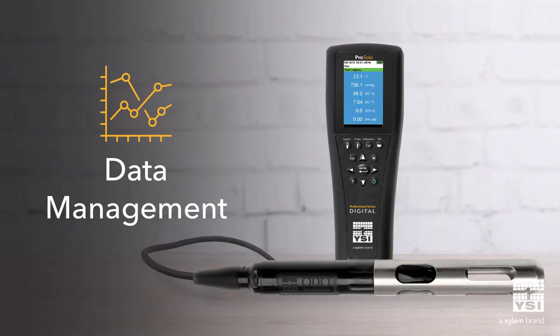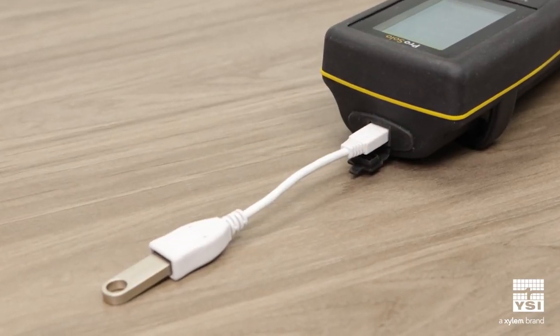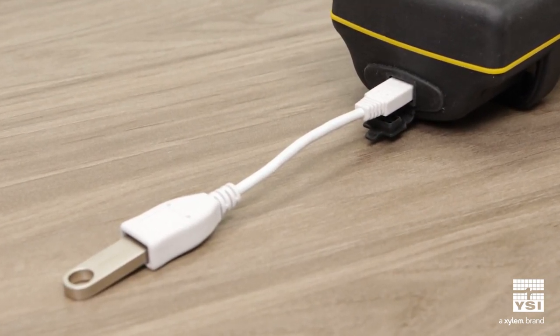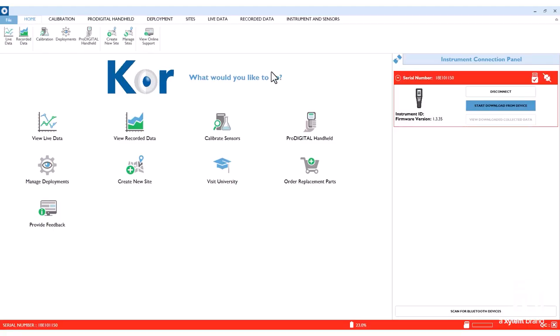Another advancement is that the ProSolo makes it easier to access your saved data. Simply connect your USB stick to the port on the instrument to download your data as a CSV file, bypassing the need to use data management software. If you prefer to use software, you can configure your instrument settings and view live or saved data with Core software.